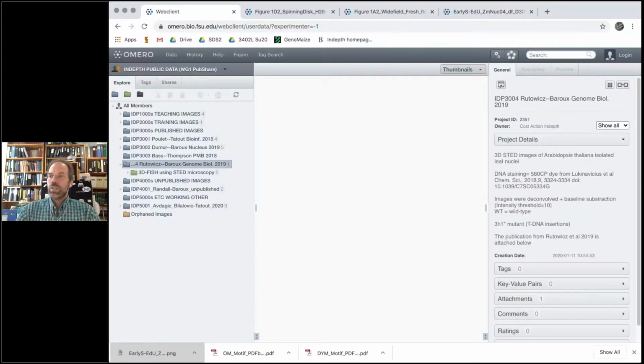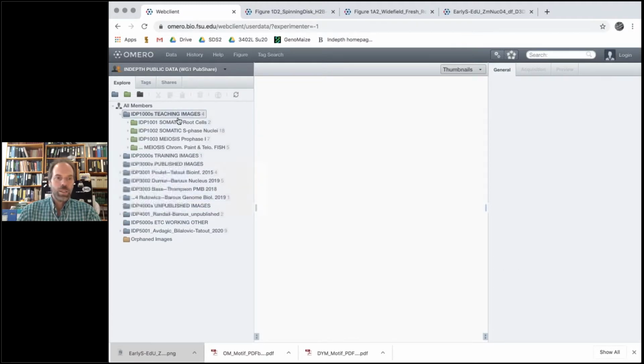And so we have a call out for INDEPTH consortium members who want to submit data from either publications or teaching. And for that, I think you may have already received an email from Paula Santos on how to do that. And basically, if you have published data sets, if you can organize them and fill out an information sheet, then we will help you load them onto the INDEPTH public repository. And this way they become available, archived, and reusable for subsequent analysis.